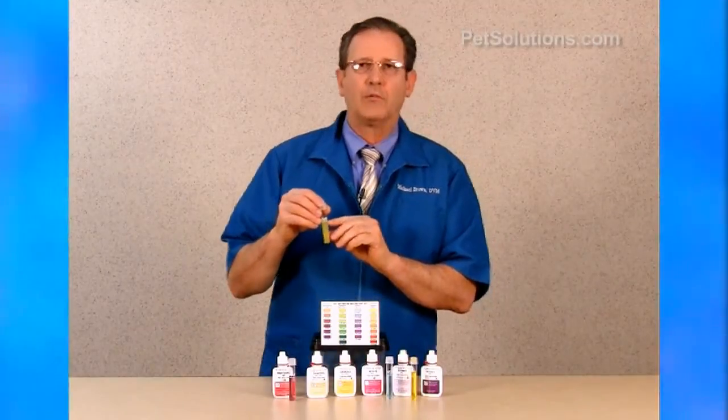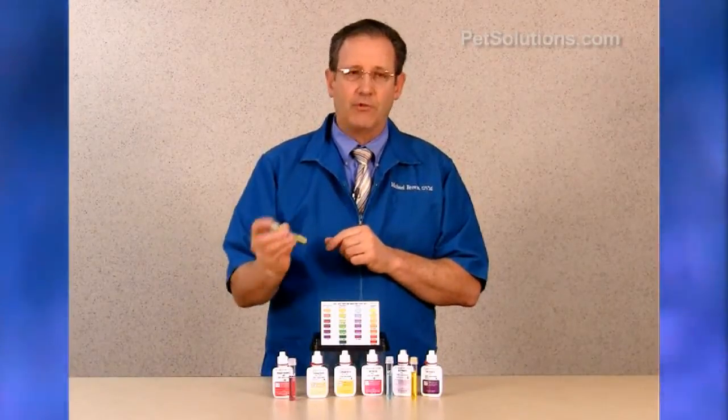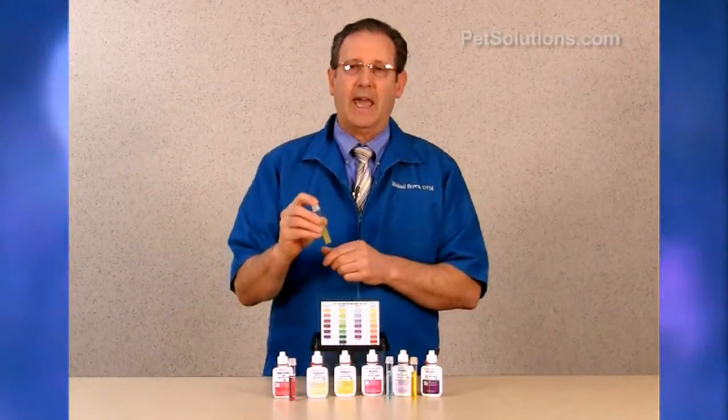To test for ammonia, fill the test tube to the line, which is 5 mLs. Add 8 drops from bottle number 1, cap and invert. Then add 8 drops from test bottle number 2, cap and invert.